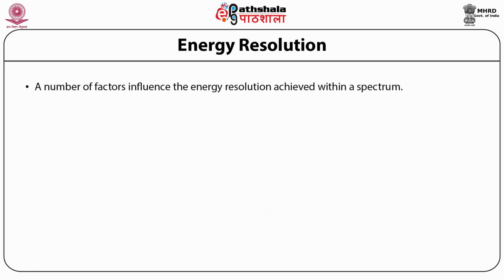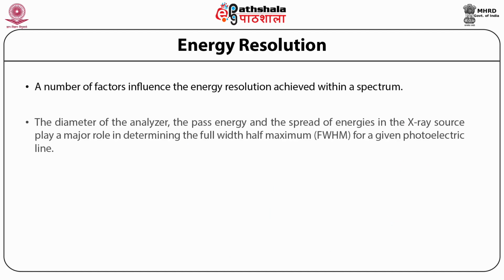Now about energy resolution. A number of factors influence the energy resolution achieved within a spectrum. The diameter of the analyzer, the pass energy, and the spread of energies in the X-ray source play a major role in determining the full width at half maximum, FWHM, for a given photoelectric line.